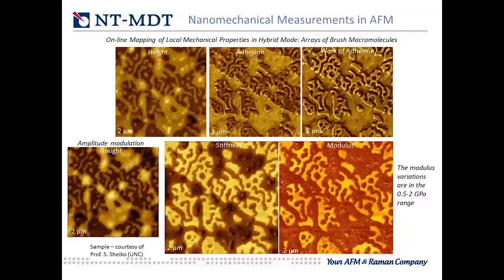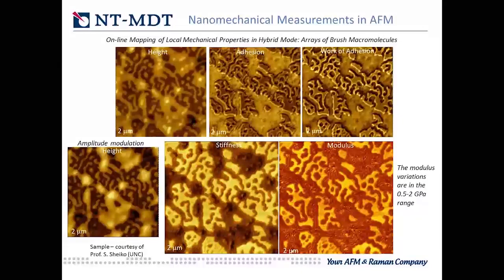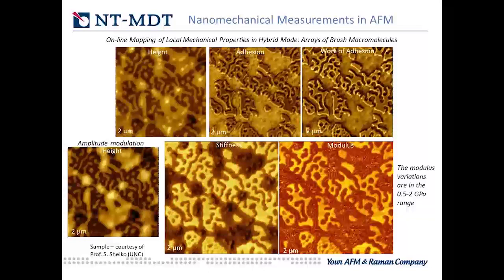Here it's an interesting observation, because when I look at the quantitative numbers of the modulus in this modulus map, you see a little bit brighter cores of the macromolecule and slightly darker surroundings, which is the location where the side chains are. And then you also have some spots where it is mica, just the substrate. The variation here is a little bit more than I expected, but the reason is that the layer is very thin, and I think the effective model is strong. It also depends on the substrate, which is mica, a relatively hard material.